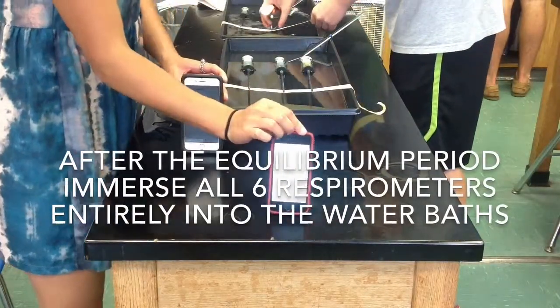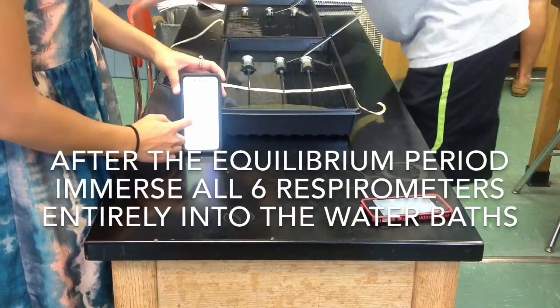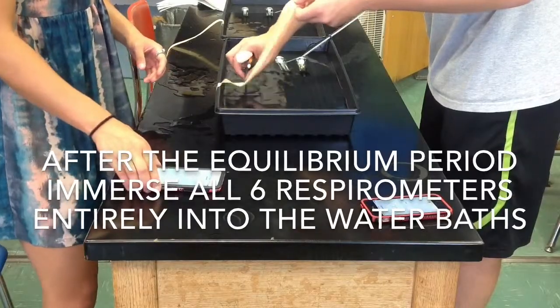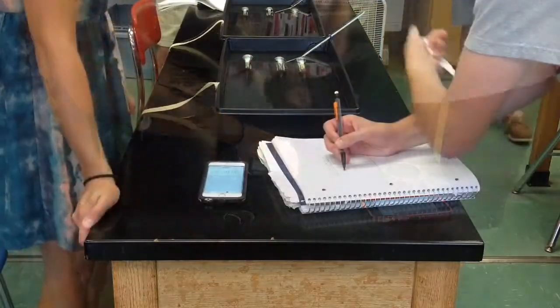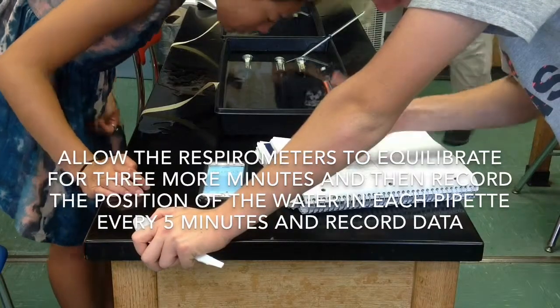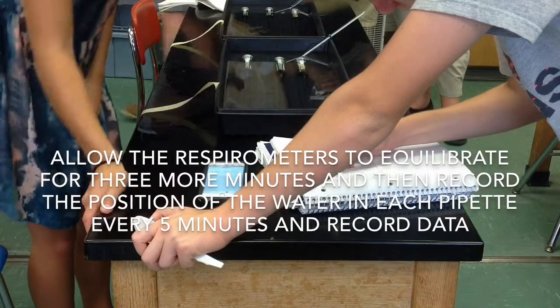17. After the equilibrium period, immerse all 6 respirometers entirely into the water baths. 18. Allow the respirometers to equilibrate for 3 more minutes, and then record the position of the water in each pipette every 5 minutes and record data.